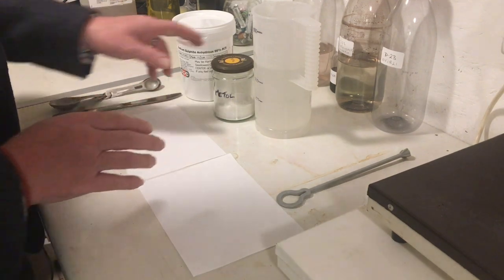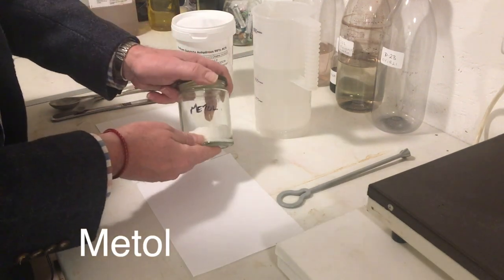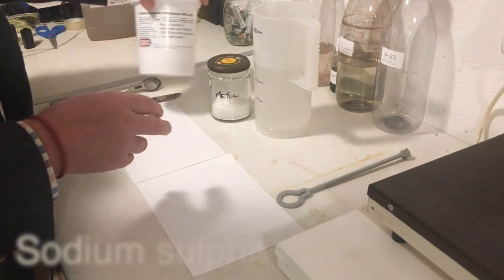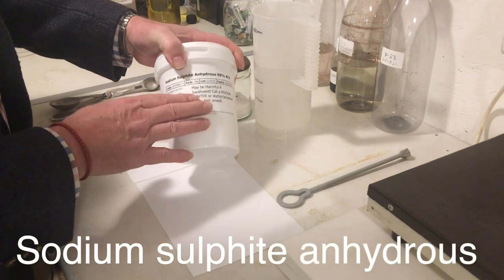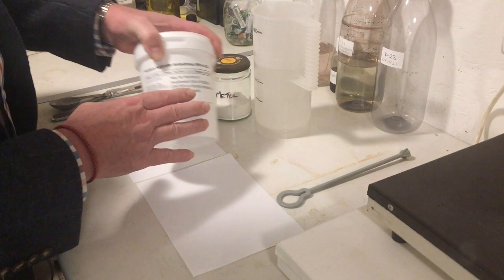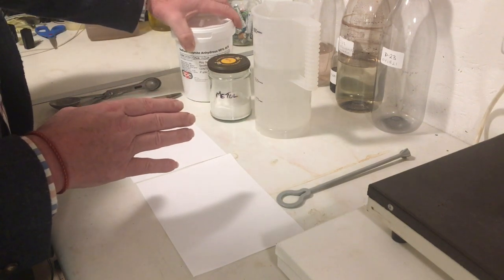So we're going to need Metol, easily bought at a photographic chemistry online store. Sodium sulfite anhydrous. This is a common chemical used in a lot of industries, easy to get hold of. They're the only two chemicals we need for D23.